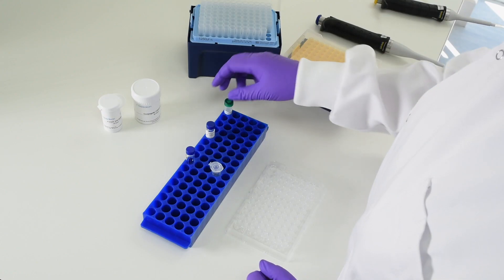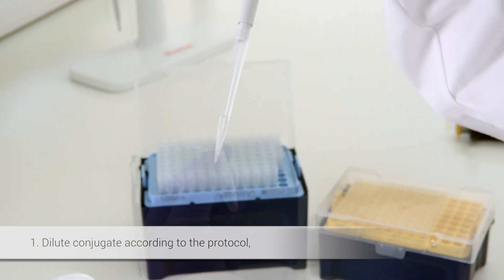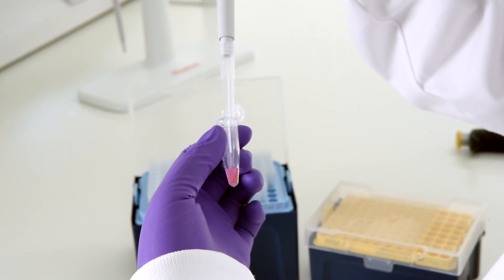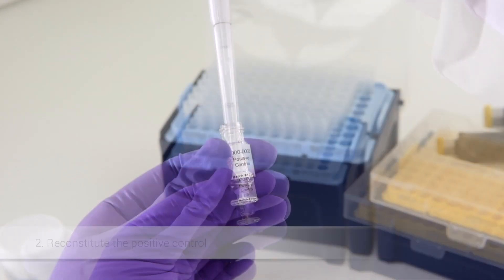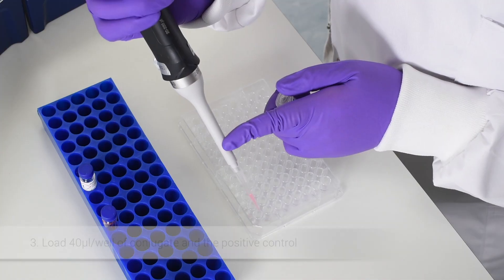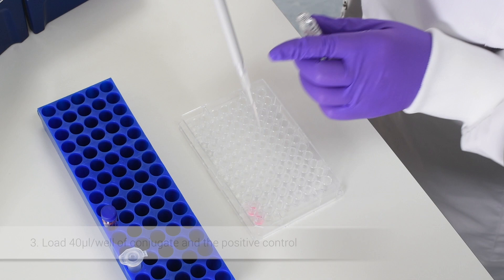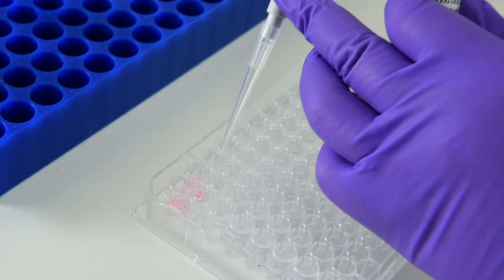The process is simple. First, dilute your conjugate according to the protocol and reconstitute the positive control. Then load 40 microlitres per well of your conjugate in duplicate into a 96-well low-binding plate or a suitable container, along with your positive control.